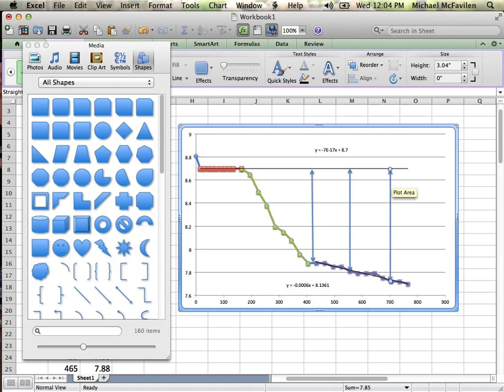Ta-da! Do we do the calculations for all different changes, like the 3 different changes in volume? Yes, you will need to do the 3 volume changes, propagate those to a heat term, a joule value. Once you have the joule value, you can average. But you have to get that joule value first.